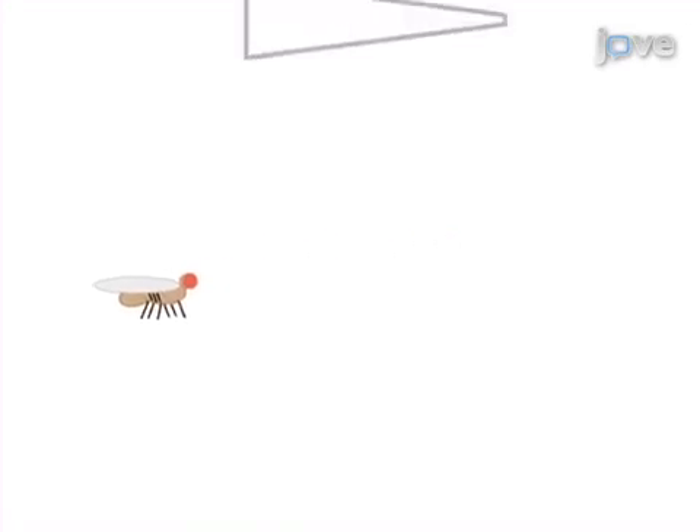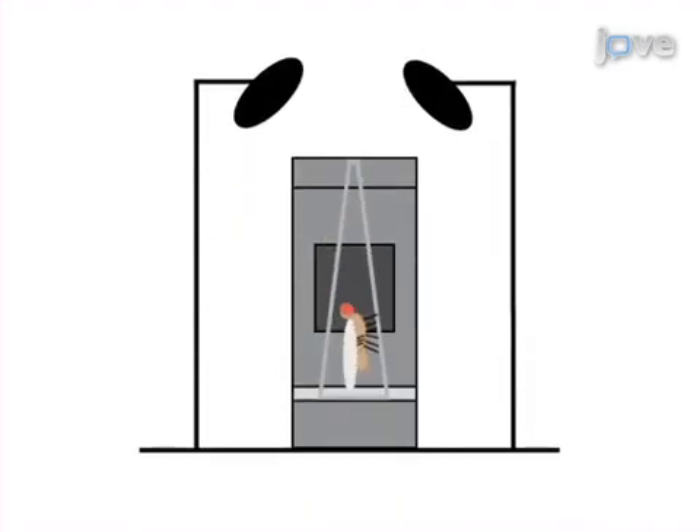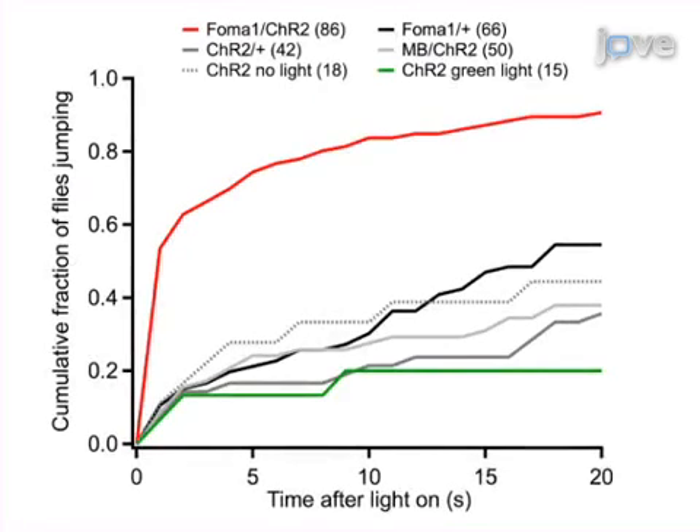The second step is to place an individual fly in a pipette tip. Next, the pipette tip is put inside a custom-built holder surrounded by LEDs. Finally, when the fly emerges onto the platform, illuminate the blue LEDs. Ultimately, recording the time of take-off shows that loom-sensitive neurons in the fly's optic lobe are sufficient for the fly's escape behavior.